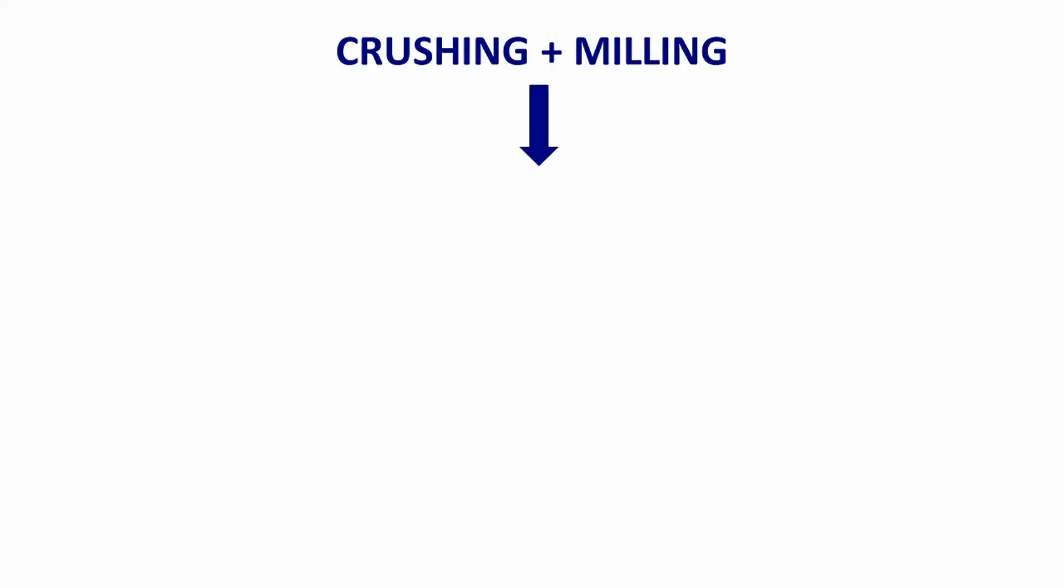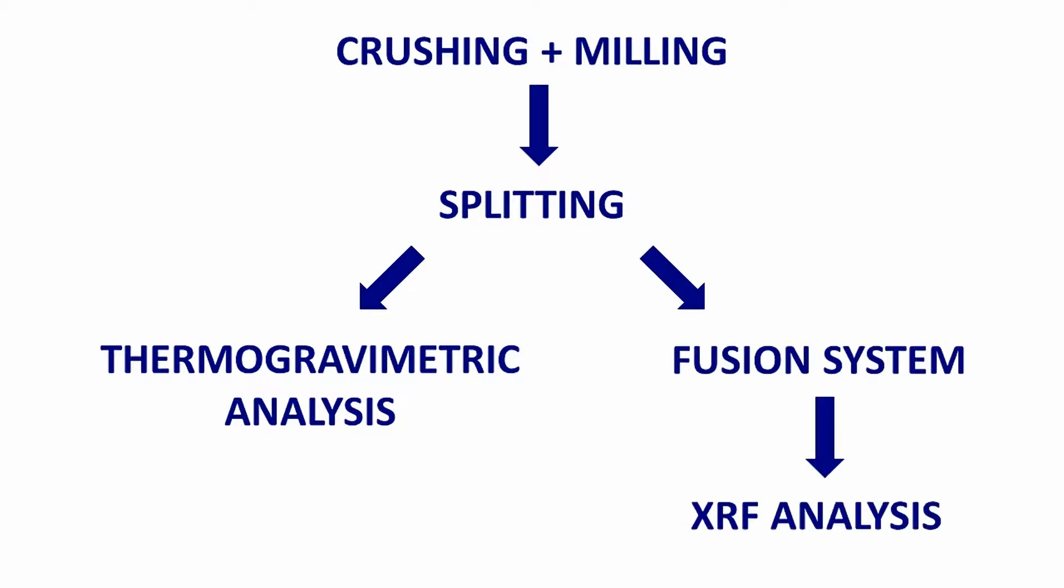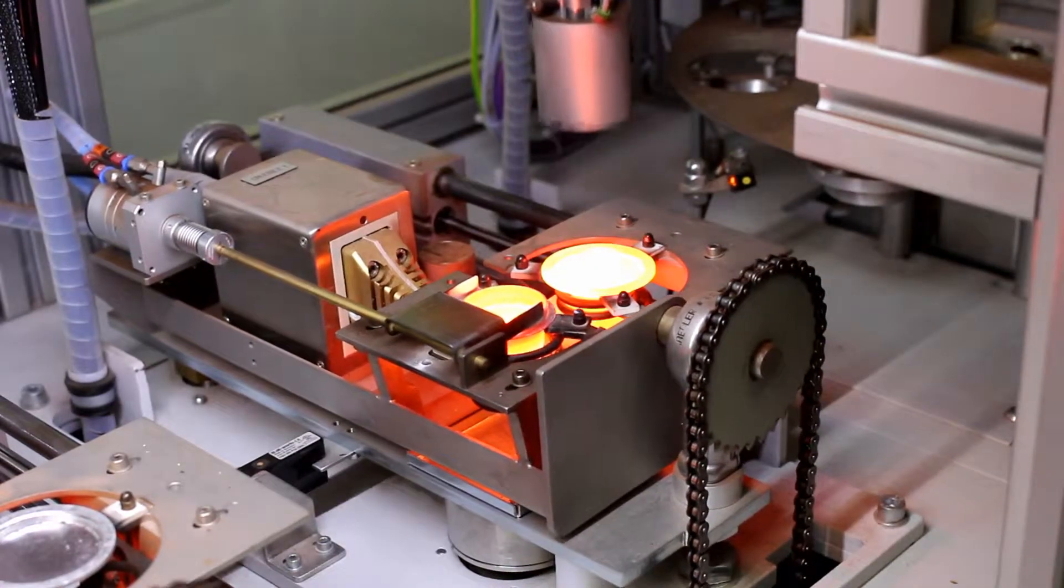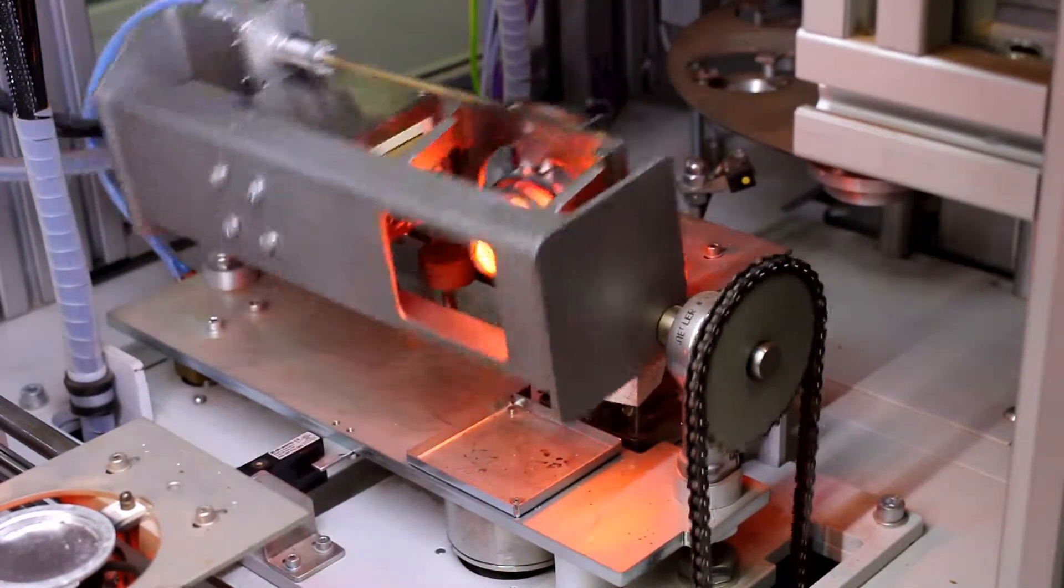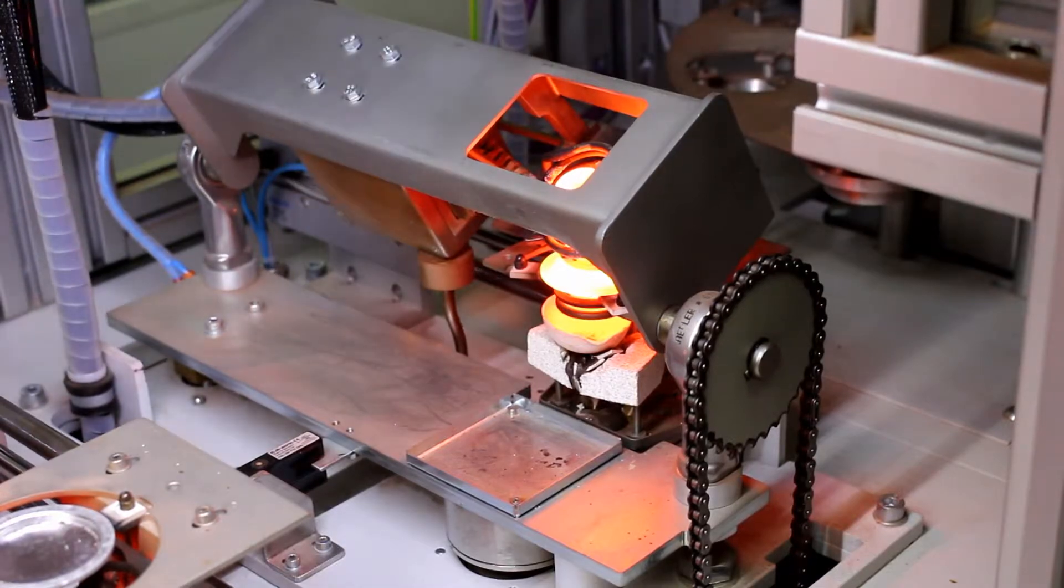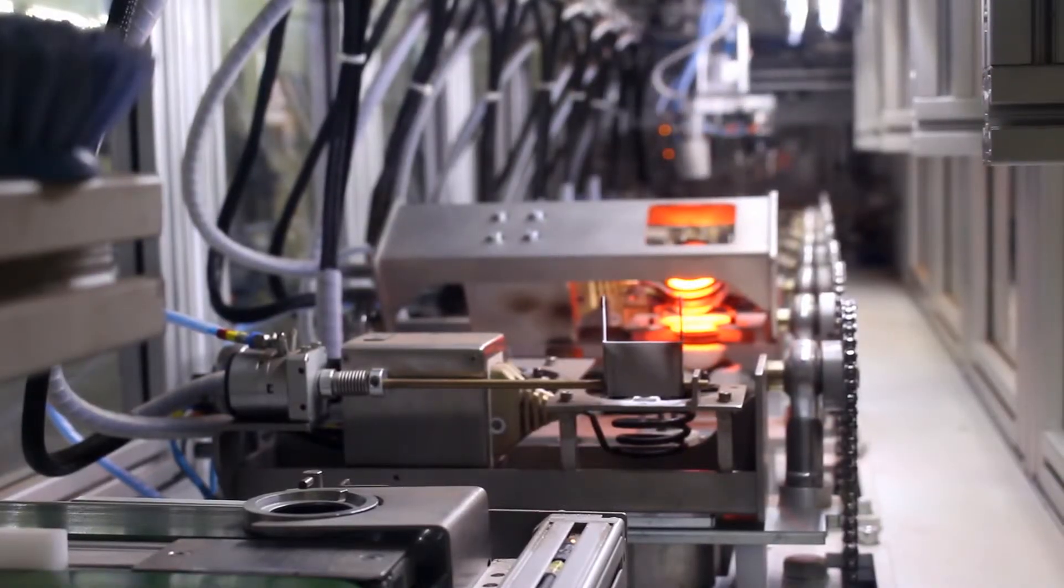Samples undergo comminution and are then split and sent to a multi-point TGA for loss of ignition analysis or to the fusion system for the production of fused beads. Up to eight beads can be produced simultaneously and are transported to the XRF machine automatically for analysis.